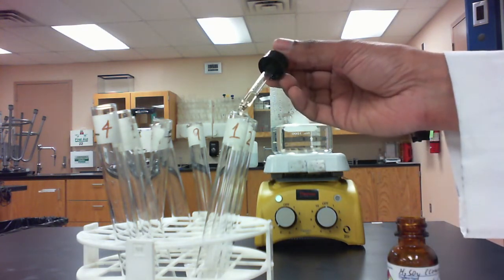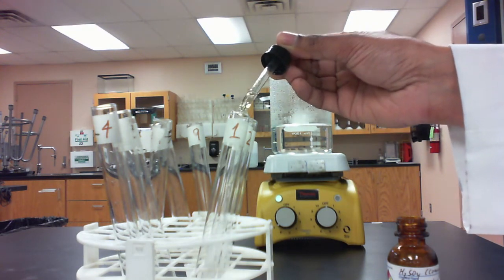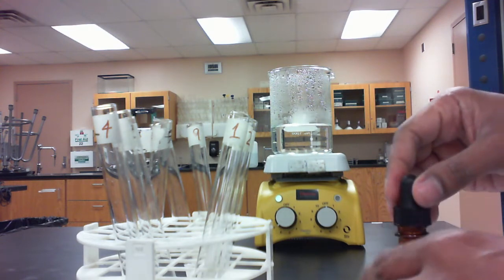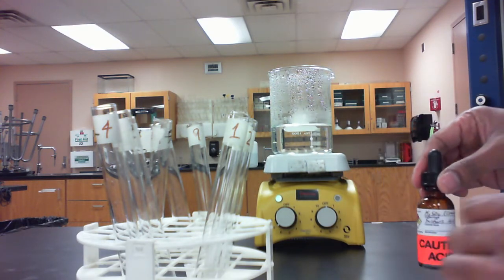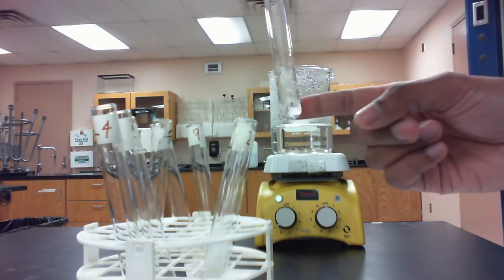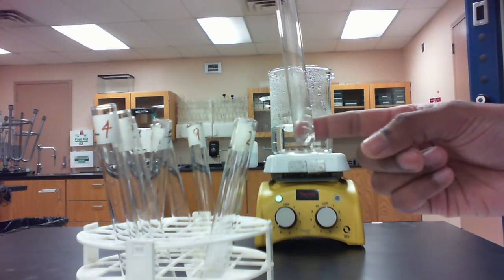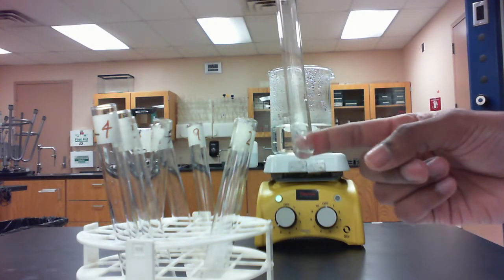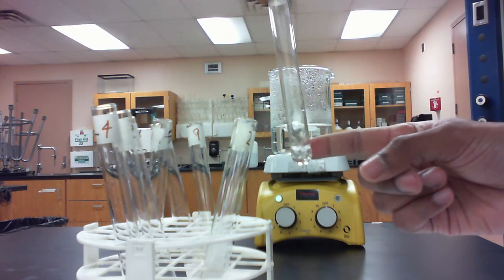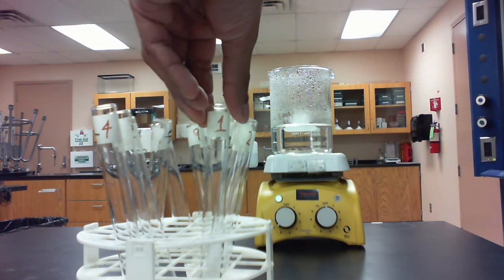So to test tube 1, we add 1, 2, 3, 4 drops of that concentrated sulfuric acid. And remember, when you add things together in a test tube or in any container, you want to make sure that you agitate the components of the mixture. You can flick the bottom of the test tube, or you can swirl a little bit just to make sure that everything is uniformly mixed.